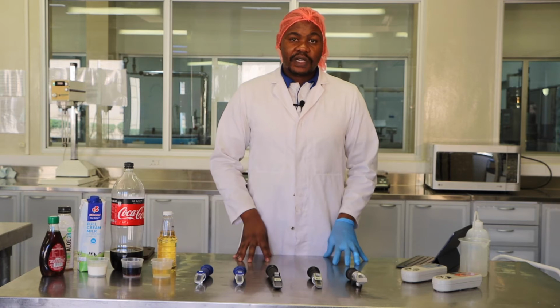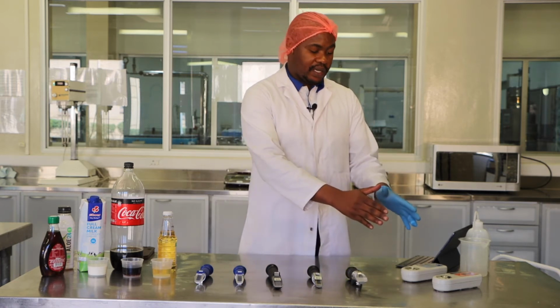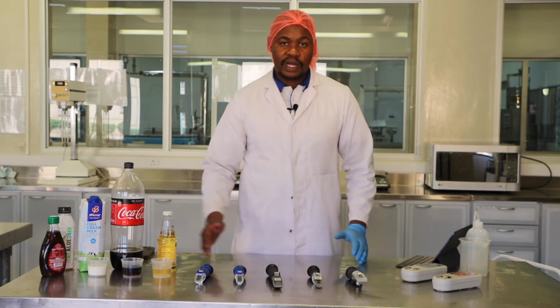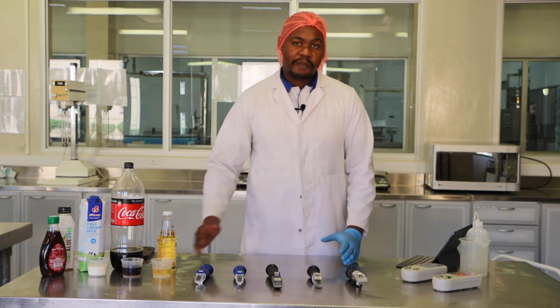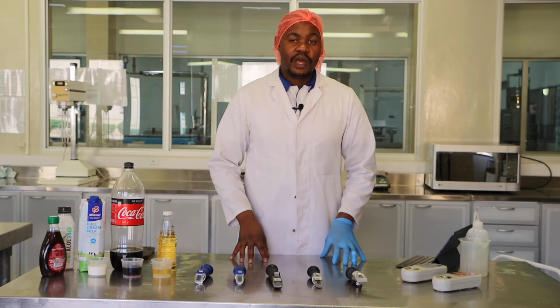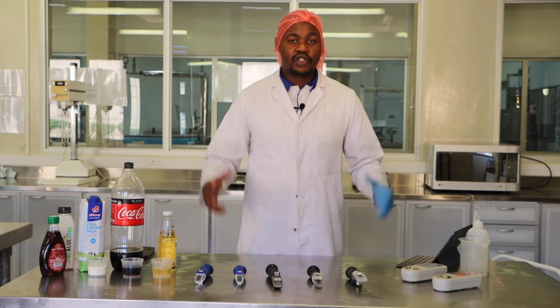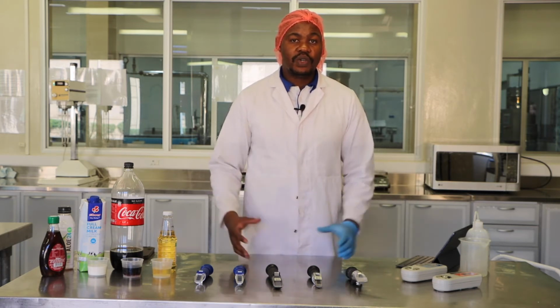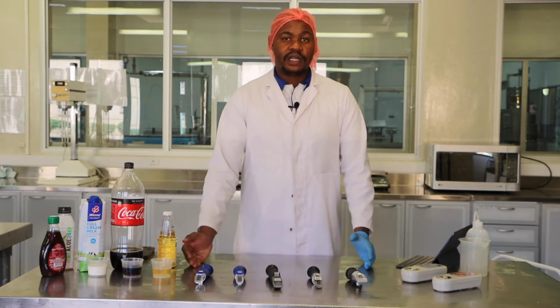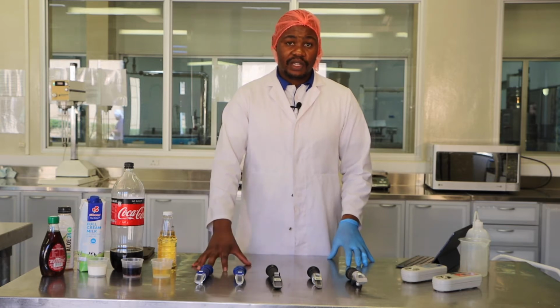When it comes to refractometers, let us take for example digital refractometers. Digital refractometers also have what we call a range, a range of measurement or a scale. As your notes would have said to you, a refractometer measures the sugar concentrations of a solution in degree Brix, from 0 to 100 degree Brix. So 100 degree Brix means that it's 100% sugar.